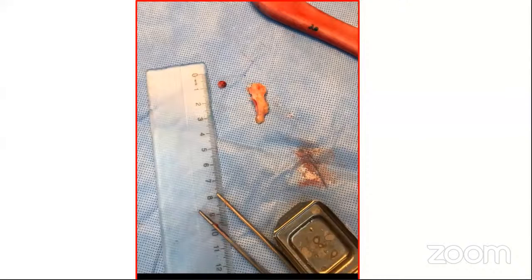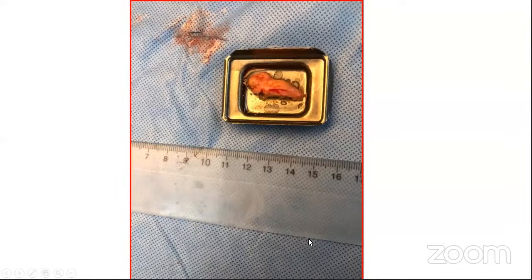We sampled the cyst, and in this section you can see the serosal surface here and the internal surface of the cyst. We will embed this piece of tissue like this, so that we can see the tumor coming from inside the cyst all the way to the serosal surface. We place the tissue inside a metal block, and we add OCT liquid.